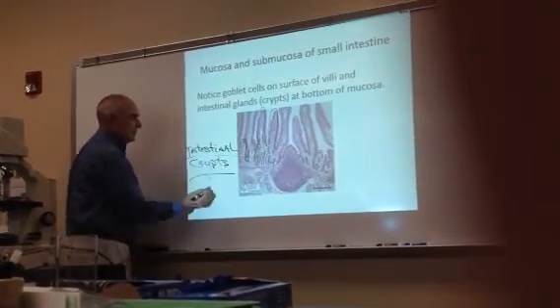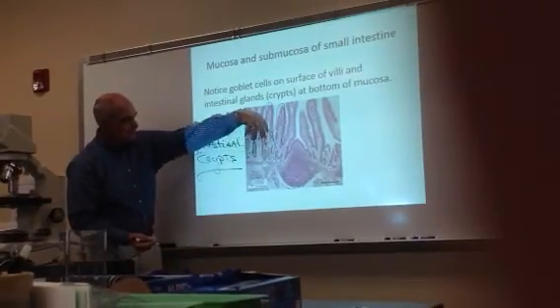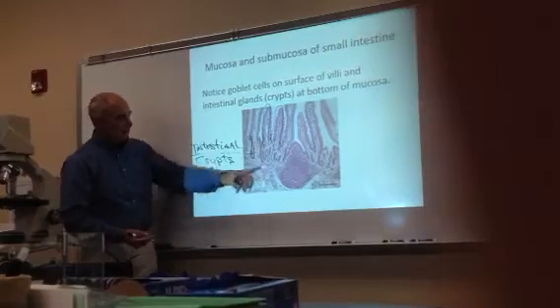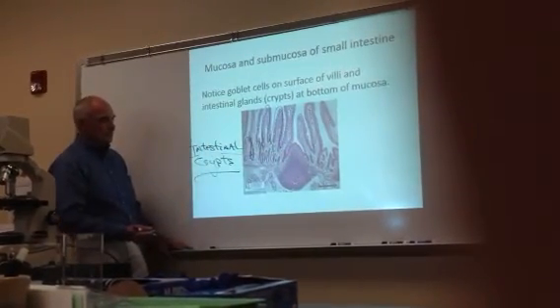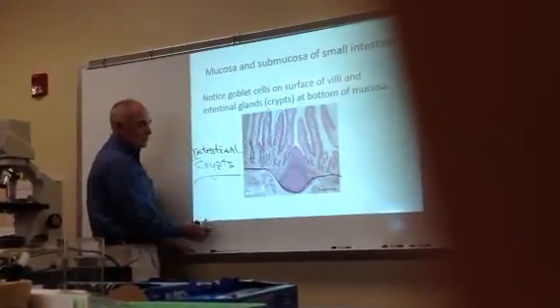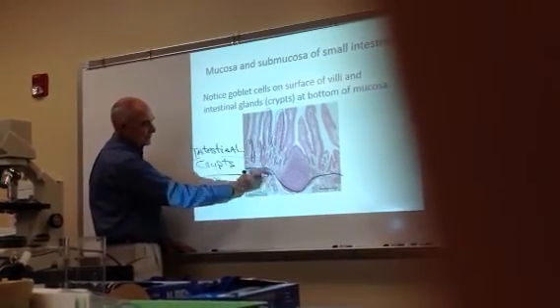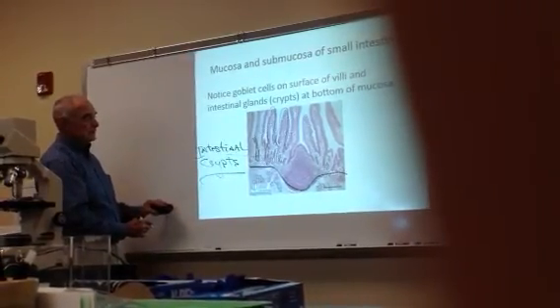And so these are called the intestinal crypts, those little penetrations down into the mucosa in between the villi. Here's some pretty dramatic crypts right here, intestinal crypts that go down there. Once again, everything above there would be mucosa. All of this down in here is submucosa. You can see the blood vessels and glands down in there.